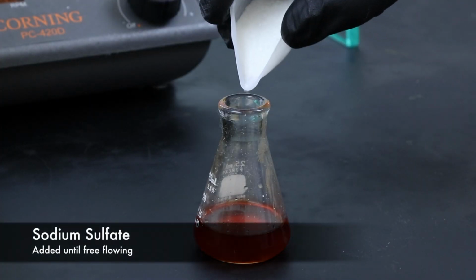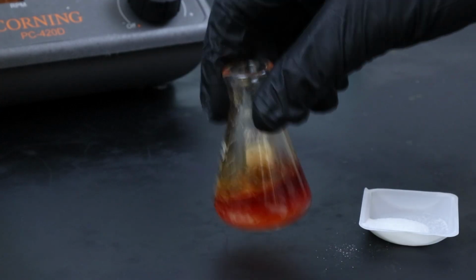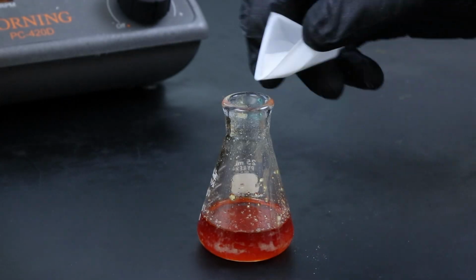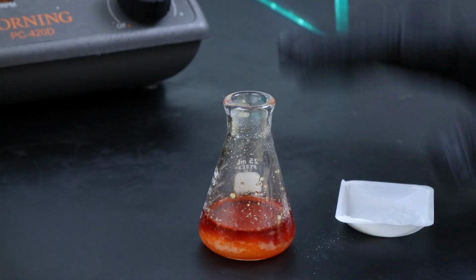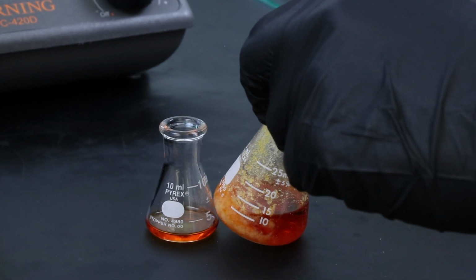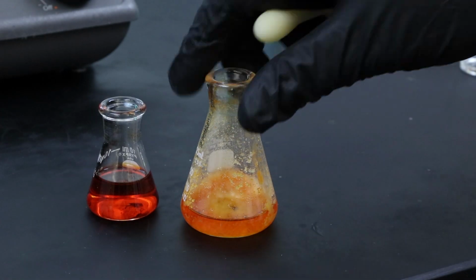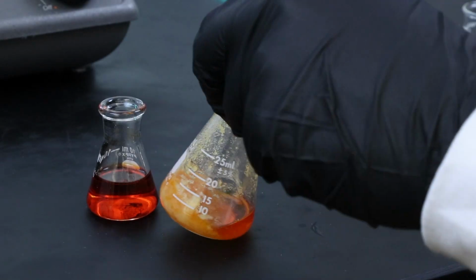Now I'll dry the extracts using sodium sulfate until it's free flowing, and it was hard to separate the organic layer from the aqueous one, so I'll probably have to add quite a bit. But once it's free flowing, I'll remove the methylene chloride solution, and since I had to add quite a bit of sodium sulfate, I'll rinse it a couple times with methylene chloride to reclaim any product that was left behind.